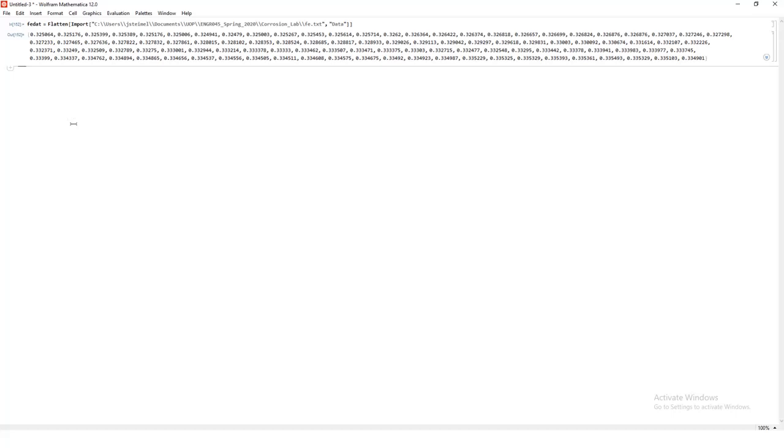You measure it. Let's call this FE dat. Looking at FE dat, let's look at the length. The number of data points we gathered is 101. Let's look at the mean. You're taking multiple measurements, so what you want to plot as your resultant EMF or voltage is the mean of FE dat. That is just going to be 0.33 volts. So that is your mean for iron.